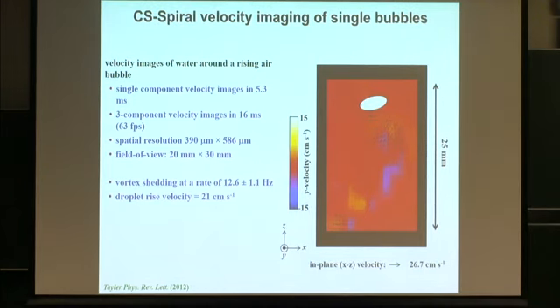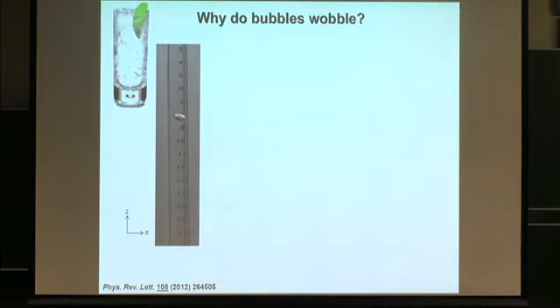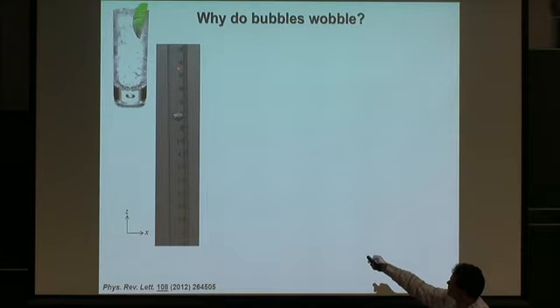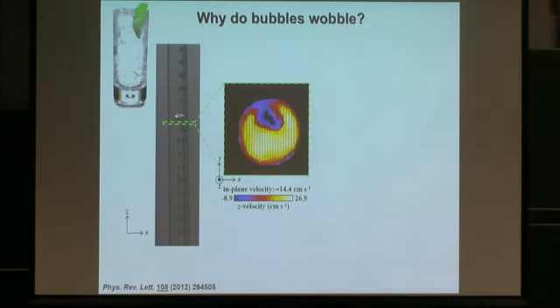To the extent that we're actually getting to the stage where we can look at gas-liquid systems, this is a gas bubble, an air bubble in water, and we can track the bubble as it moves up through our system, identifying what's going on in the wake. Now, if we want to identify more carefully what's going on in the wake, we have to think about suspending this bubble. So we've got fluid passing down here, and the bubble being suspended, and then we can concentrate on taking images on a plane below this and identify several things from this.